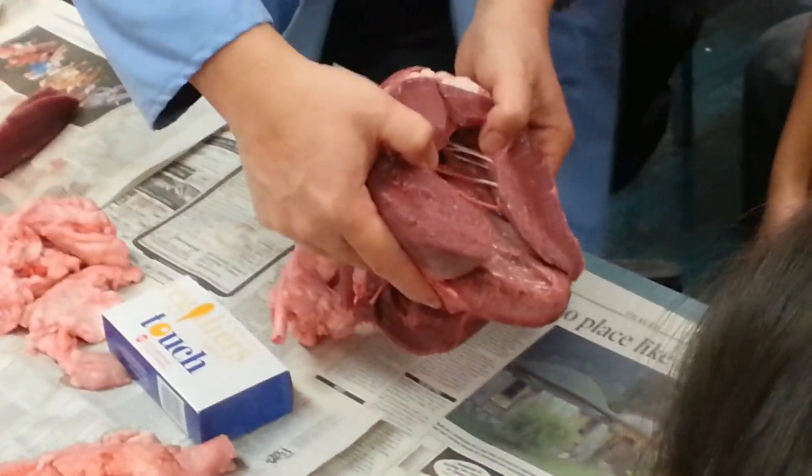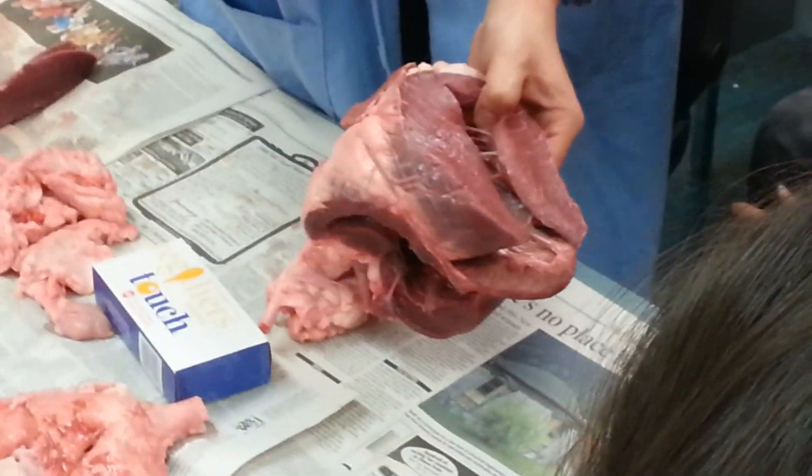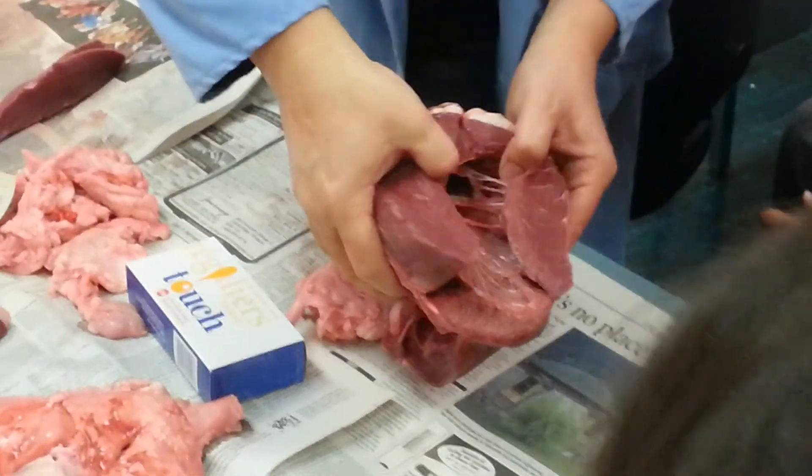Do you see here? The bicuspid valve right there. It's an AV valve, but there's two pieces to it. Can you see the two pieces? They're kind of turned sideways right now — they're not like this, they're turned sideways. One, two, right there like that.